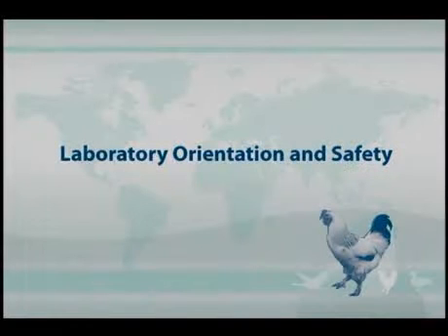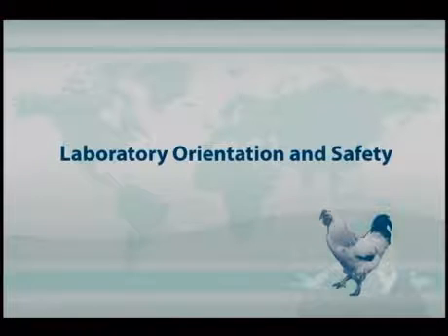In this presentation, we're going to cover some of the standard operating procedures with regard to the safe handling of diagnostic samples in the laboratory. And of course, with the recent emergence of the highly pathogenic H5N1 in Asia, Europe, and Africa, safety has been a much higher concern than it has been in the past with regard to working with samples suspected of having avian influenza.